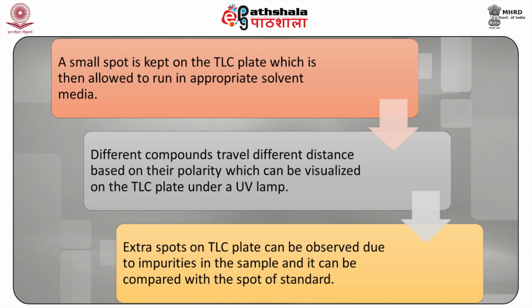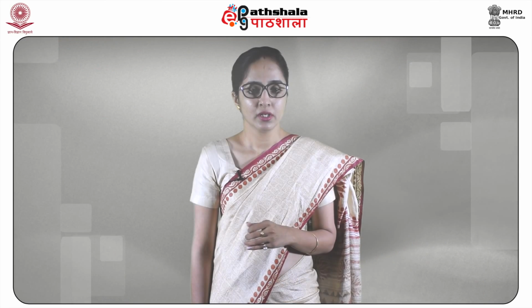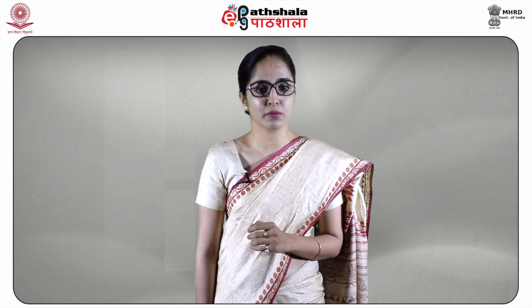Now, extra spots on the TLC plate can be observed due to the impurities in the sample, and they can be compared with the spot of the standard sample. Now you can realize how important UV spectroscopy becomes in the determination of a particular organic compound.